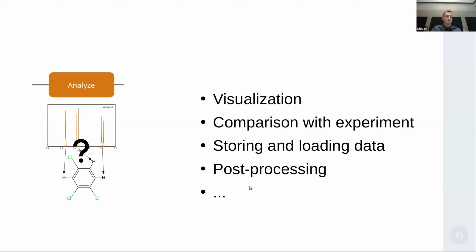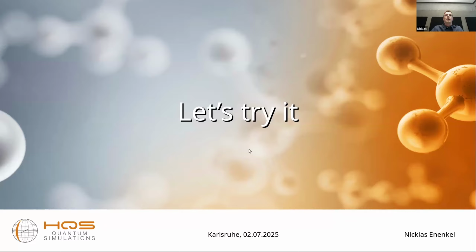So the chemical shifts, for example, have a certain associated error with them. And we have a tool called Shifting the Shifts, which you can access online, which helps you to mitigate these kind of errors. Although I will not talk about this further today. So with this, I will go to the section where we go a bit into the code.